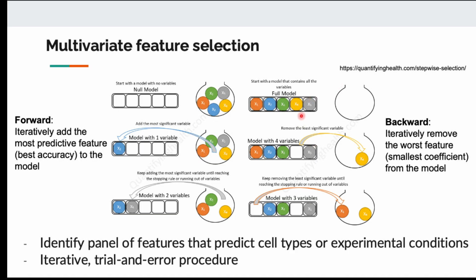The other idea is you start with the full data. You use all the columns to build your model. So basically, your model is going to be very large. You will have a lot of coefficients for all these numbers, like a thousand numbers. Then, as we are going to see, maybe not now, but in future lectures about machine learning, when you build a multivariate model, whichever model you use, there will be a technique that will allow you to tell among these columns, among these inputs, which one is the worst, which one contributes the least.